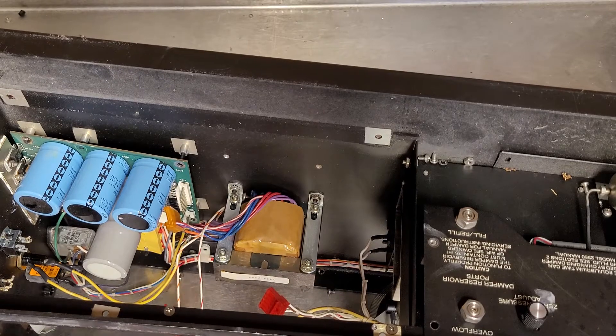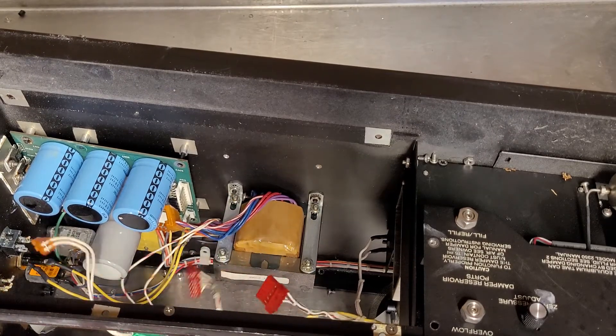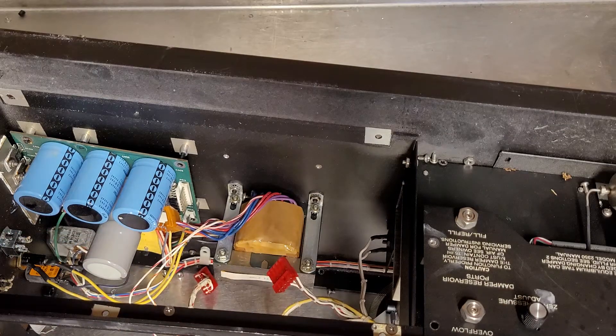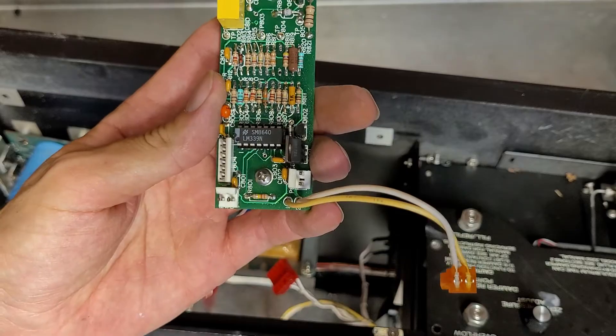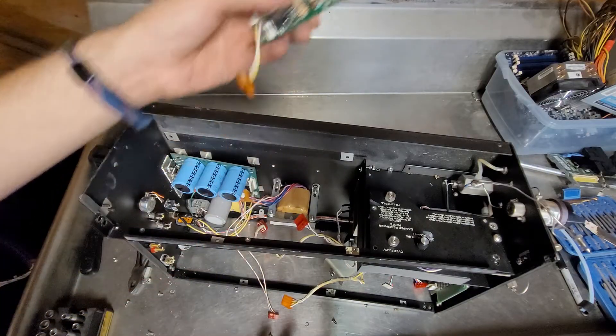I think the next thing I'm going to have to get out is the pump assembly, but I'm not certain how quite yet. I have to look to see what this chip is, see if it's worth saving — the LM339N. I don't think it's an op amp or anything useful like that.